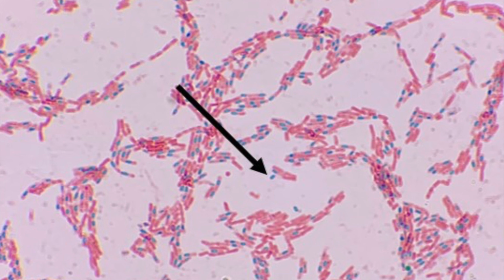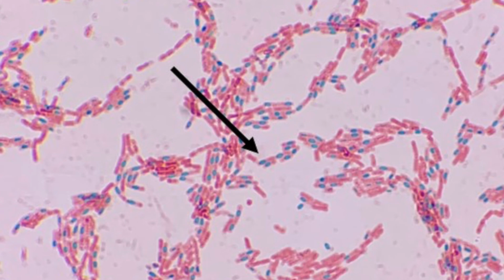So the arrow I have pointing is at what is called a free spore. So it's that green color, that malachite green that I was telling you about. And this is where the vegetative cell has already died off. Now the arrow is pointing at the endospore, and that is where the vegetative cell has not died off yet, so you can still see the spore inside of the vegetative cell.